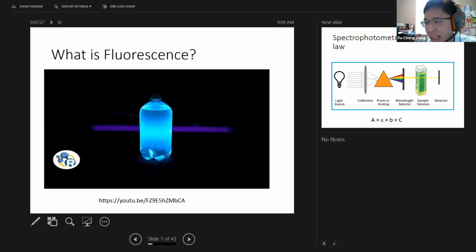In this video they want to do that as well, but they are going to show you tonic water, the kind you can see in a club. When you shine UV light on it, the tonic water shows fluorescence because it has some chemical inside. So let's watch this video right now. Hopefully it's going to work. Okay, here we go.